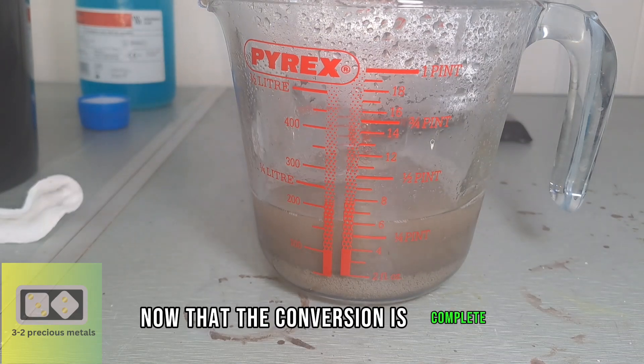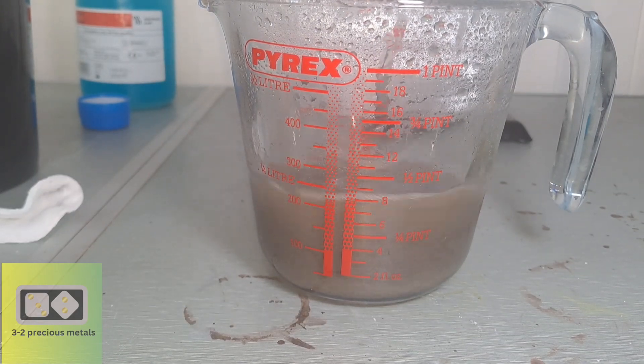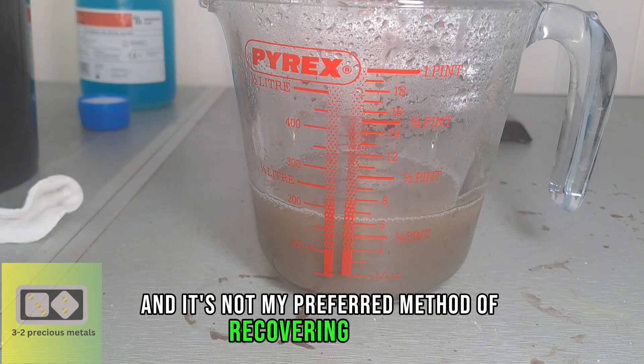Now that the conversion is complete, I have to rinse off all the chemicals. There is a lot of rinsing involved when using this method, and it's not my preferred method of recovering silver.